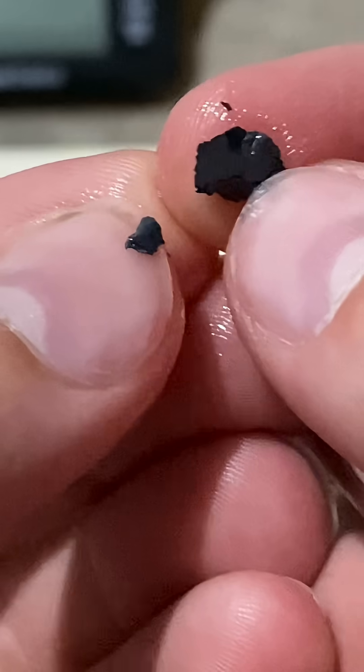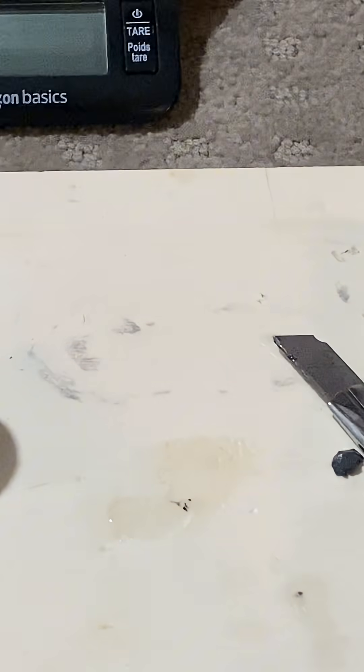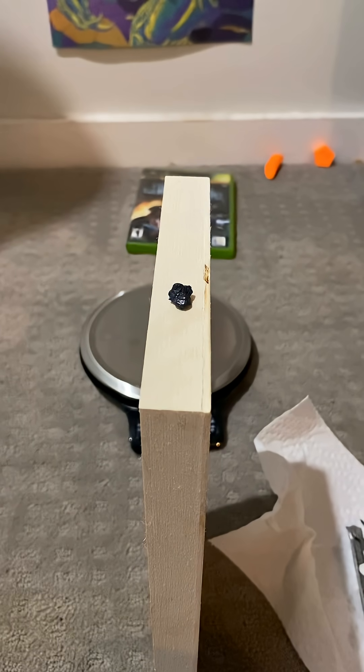It's a pretty soft metal. You can break pieces off pretty easily and even cut it like I was just showing you. Here's the piece of lanthanum after about three minutes of being cut.